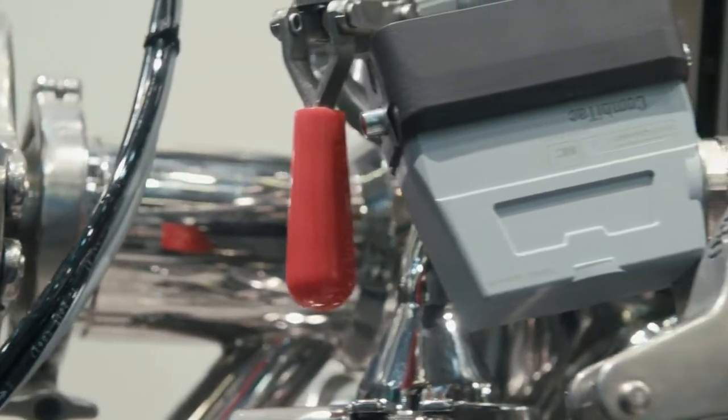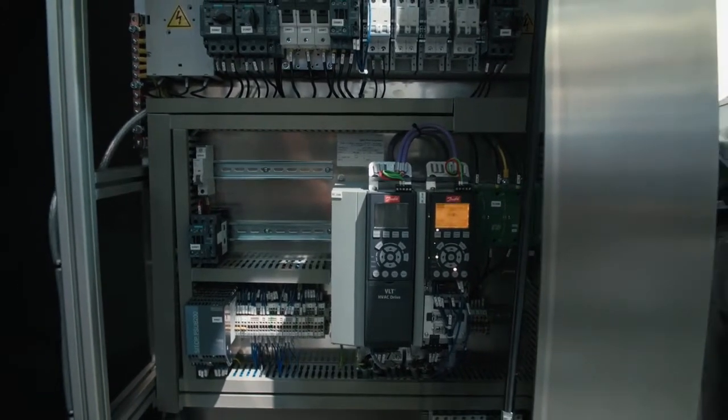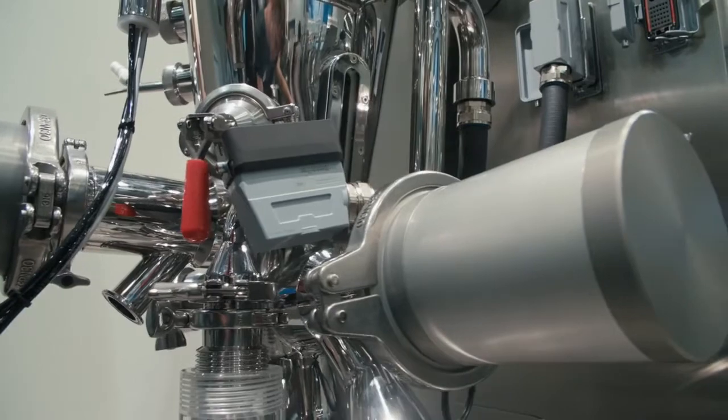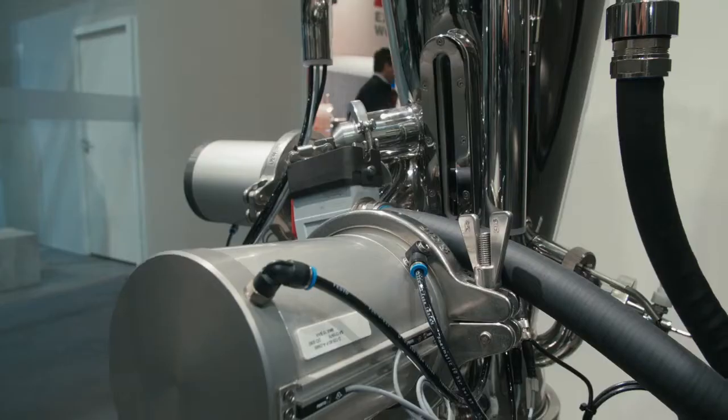The really key thing about AirConnect is it gives you the flexibility of running small batches from 100 grams right the way up to 10 kilogram capacity — with that big range of capacities all from a single piece of laboratory equipment. That's all done by the modular basis of the AirConnect, which mimics very much the very successful PharmaConnect system that we use for our mixing and blending processes.